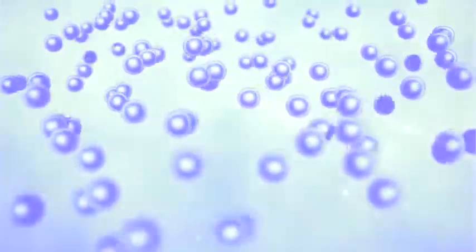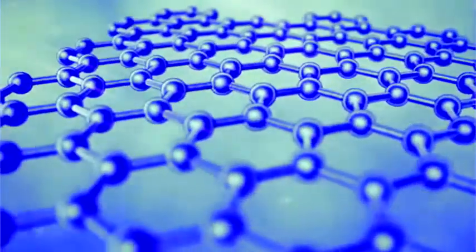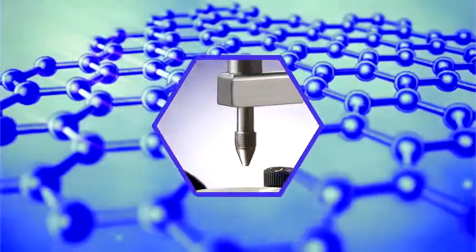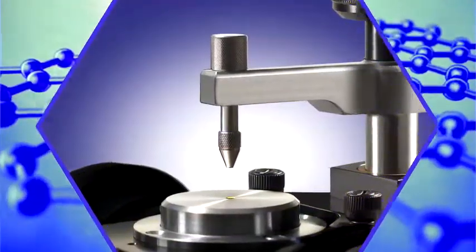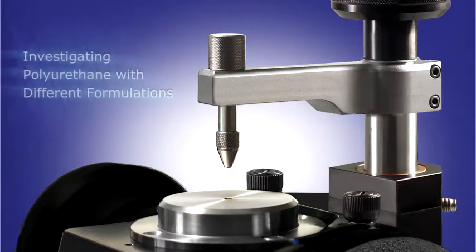In polymer production, it's desirable to have a fast and reliable method to evaluate formula accuracy. Infrared analysis may offer a solution. This video application note illustrates the point by investigating polyurethane with different formulations using ATR sampling.